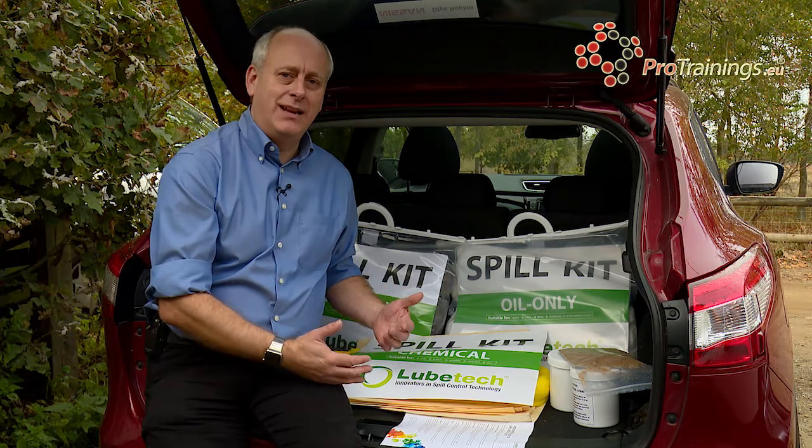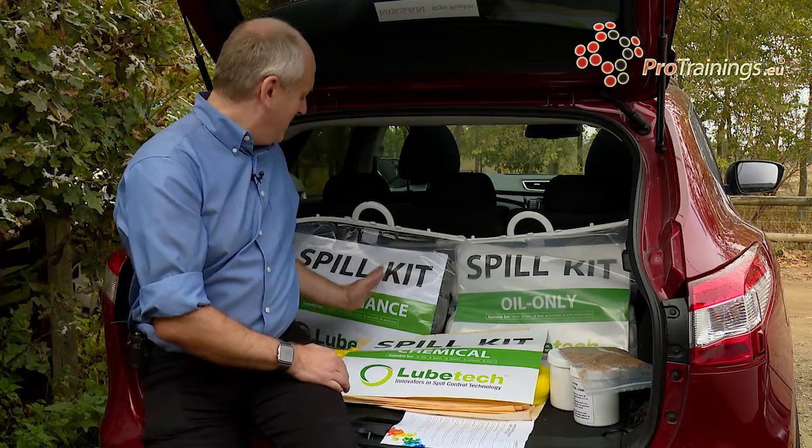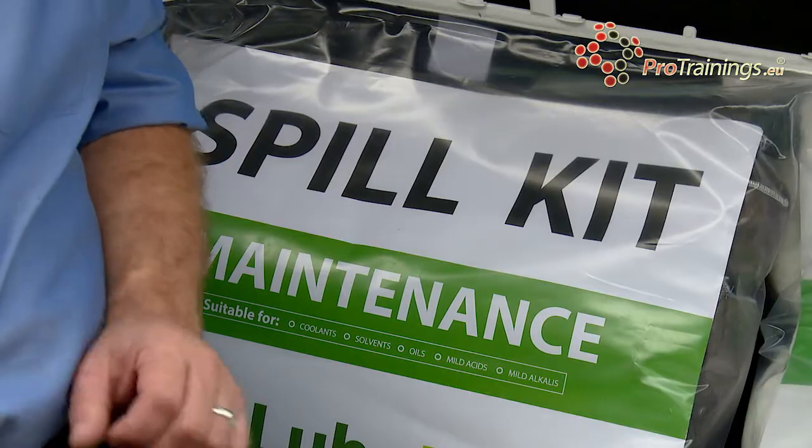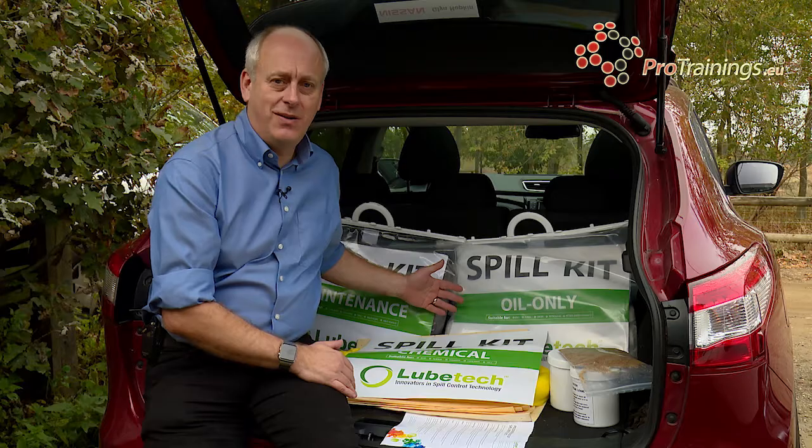We are now going to look at chemical spill kits. There are three main types of chemical spill kit we have here. The first one is what is called a maintenance kit. This is ideal for things like coolants, solvents, oils, mild acids and mild alkalines.